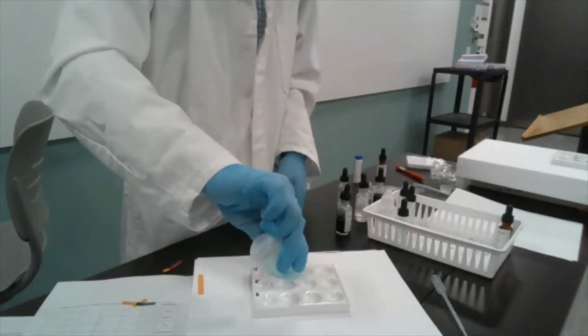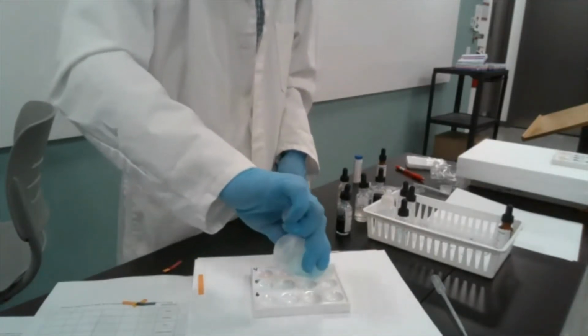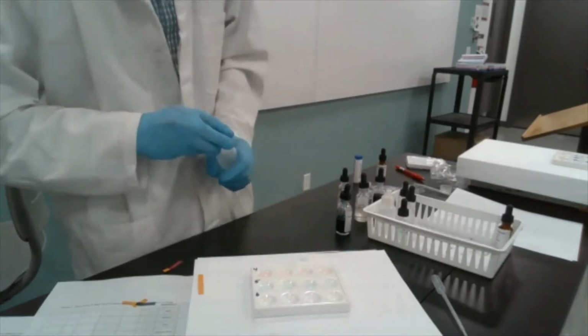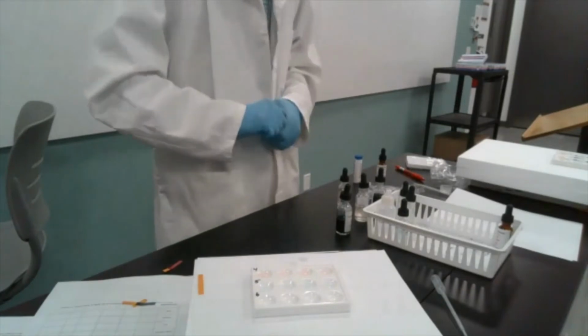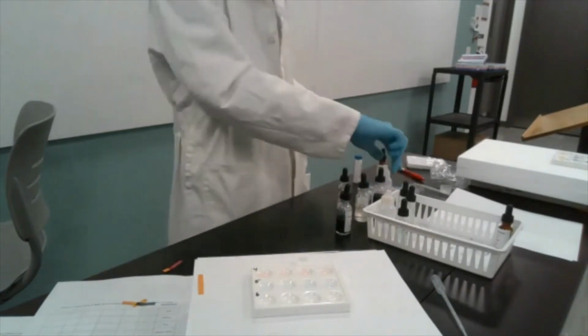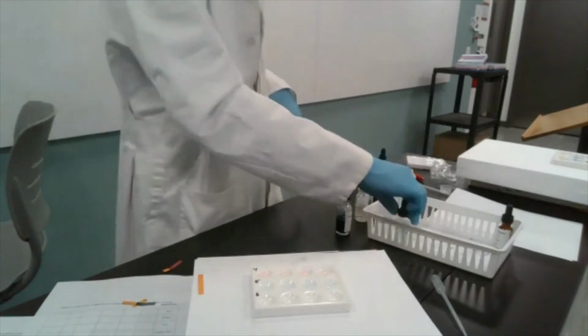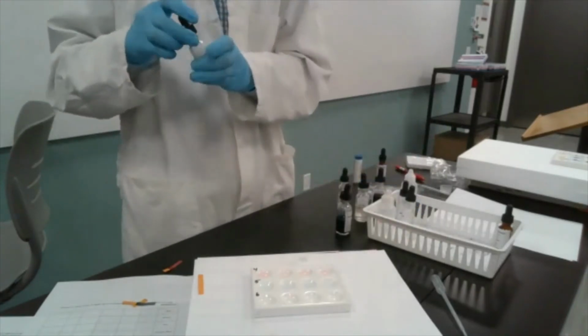So this is the glass cleaner, and sometimes it's also known under the name ammonia cleaner. So that gives you an idea about its chemical nature as far as the prediction goes. And you can use that knowledge.